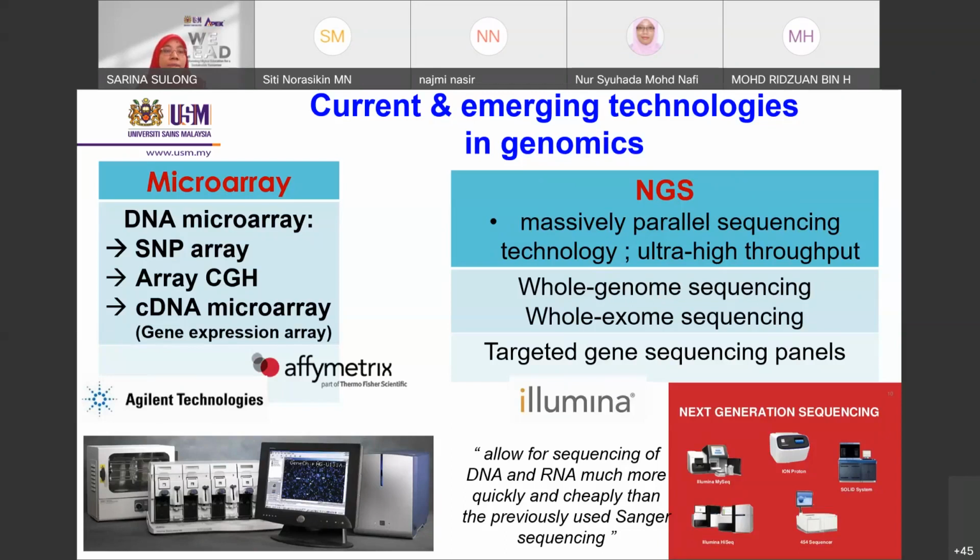Okay, so SNP array, single nucleotide polymorphism array, is a type of DNA microarray containing designed probes harboring the SNP positions, which are hybridized with fragmented DNA to determine the specific alleles of all SNPs on the array for the hybridized DNA samples. So they use the SNP information that has been put in the DNA array. This array is considered to be one of the high throughput, relatively cost efficient and automated genotyping approaches.